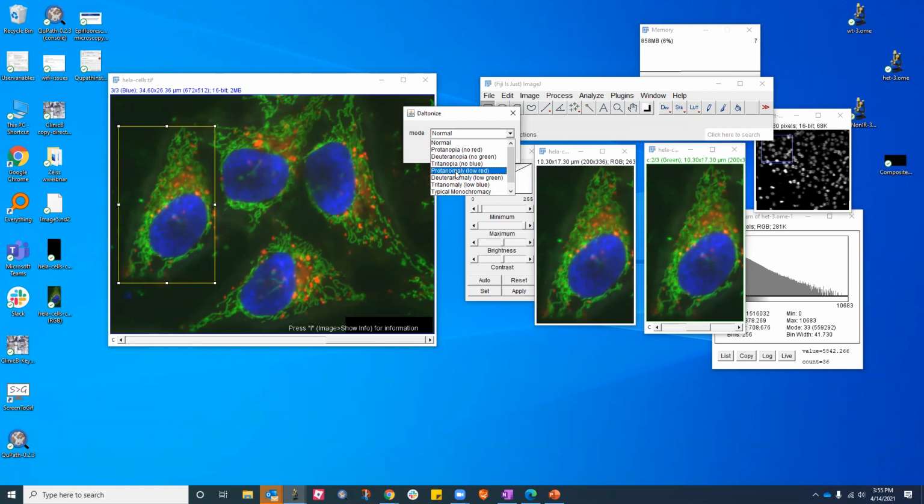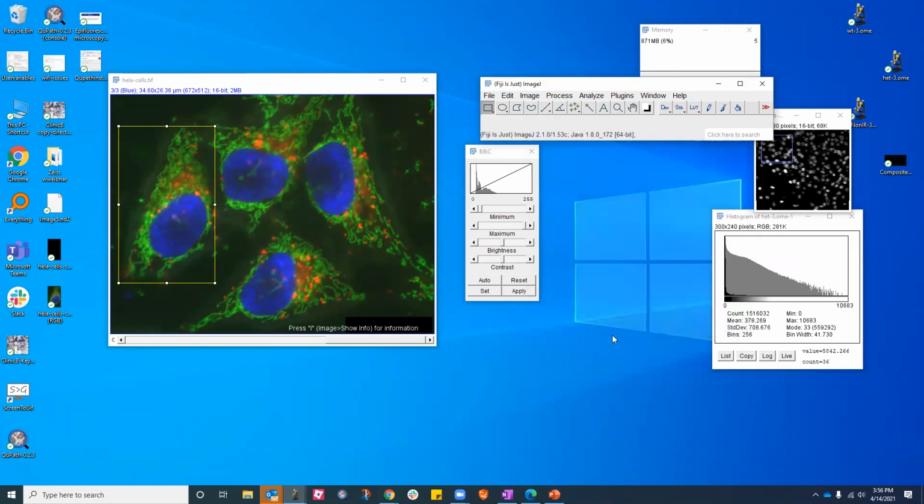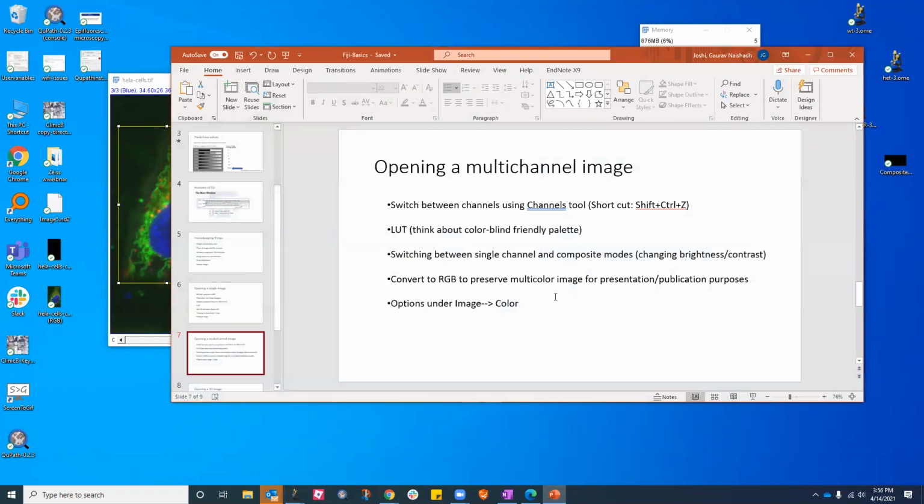This is what a person with a certain condition will look at the image. So though it is like this, when they look at it, it will look something like this. Right. Okay. So that's where using magenta is really important. Okay. So save that. That's good. And all of this is good.